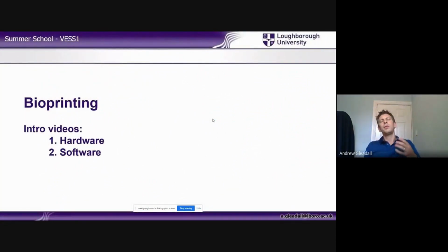Okay, so then bioprinting is a variant of extrusion 3D printing, and I'm going to show you a couple of videos now from a manufacturer that's going to go through quite a few of the aspects of firstly the hardware, the bioprinter itself, and secondly how we use it. So basically telling the machine what we want it to actually print.